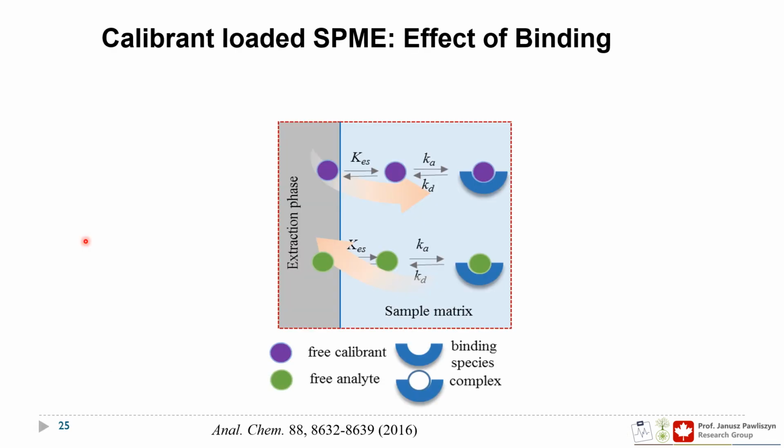Now, understanding this multi-phase equilibrium will also allow us to design a new calibration procedure. What we discovered is that the desorption rate of the calibrant from the coating is the same as the extraction rate of the analytes from the matrix for most biological matrices.